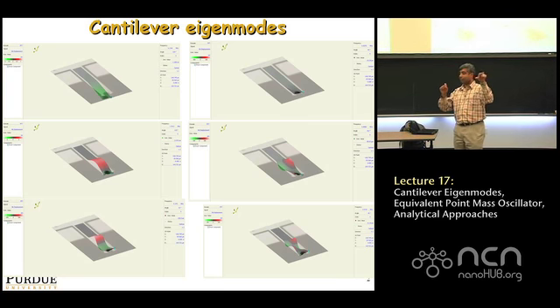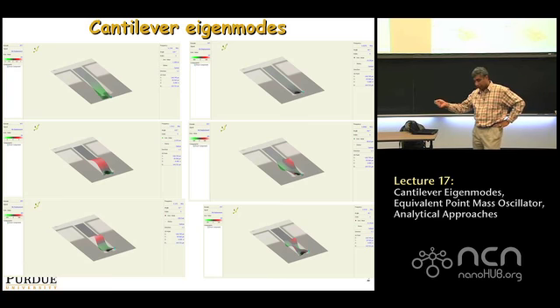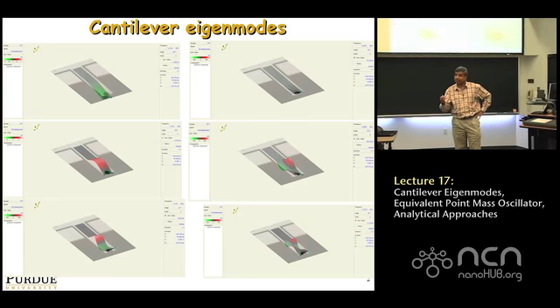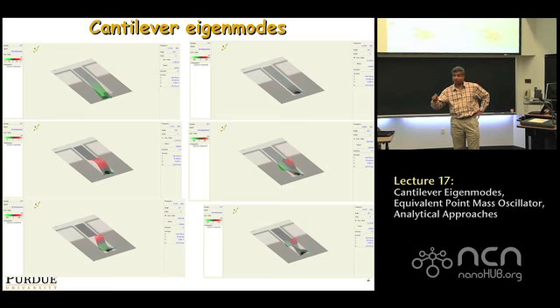So remember that when we did all our modeling of cantilevers, we simply had a tip. We modeled the cantilever as a spring with a spring constant, and we just had a tip at the end of it. In reality, what happens is if you take a cantilever and you do a frequency tuning, at certain specific frequencies, you hit a resonance, the amplitude increases. When it does hit a resonance, it shakes or oscillates in a very characteristic shape. Okay, so if you took a normal AFM cantilever and you swept up the frequency, the first drive frequency at which you get large amplitude motion is the first resonance, right? And we basically get large amplitude motions whenever your drive frequency equals natural frequency, okay?